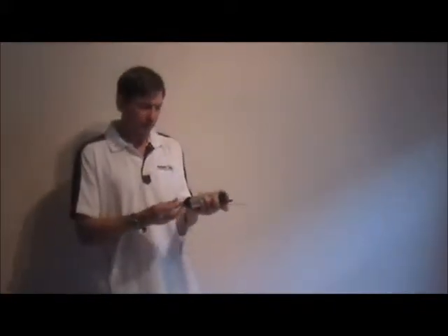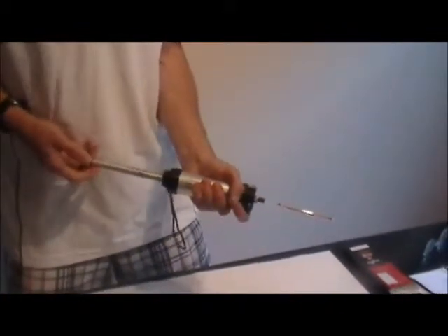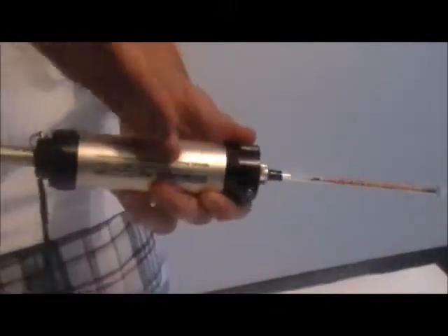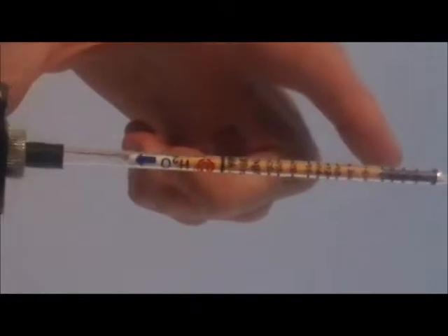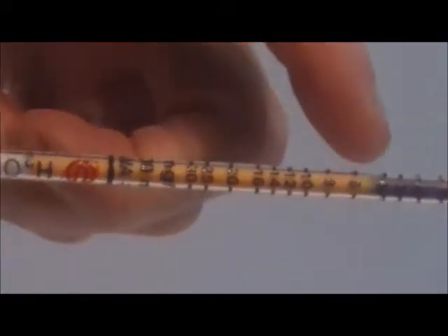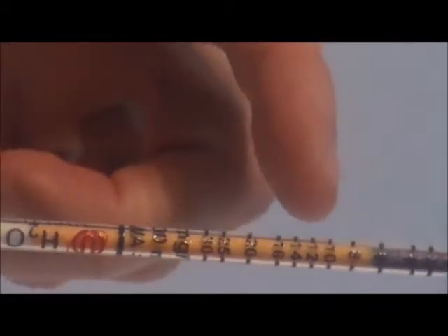First, I'll demonstrate an overview of how the gas detection tubes work. The tubes contain a chemical reagent that changes color when a particular compound in the gas sample is present. The hand pump pulls a fixed volume of air into the tube. The piston pump pulls 100 cc's and you can see the tube changing color as the water vapor is being absorbed into the chemical reagent on the tube.